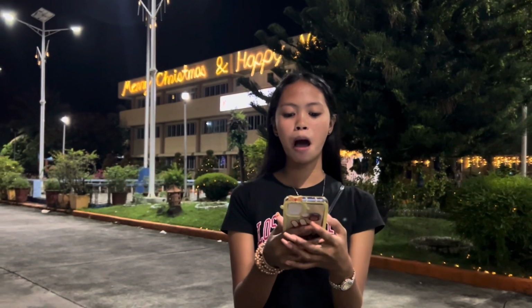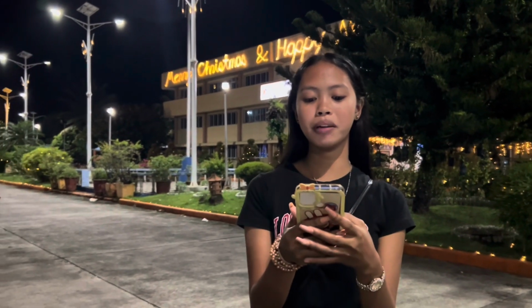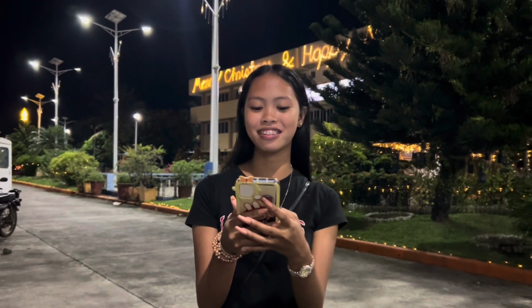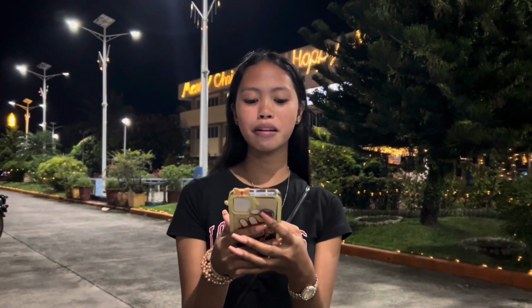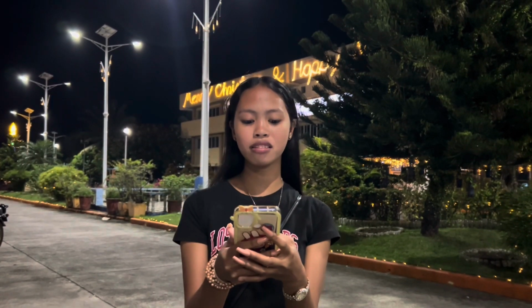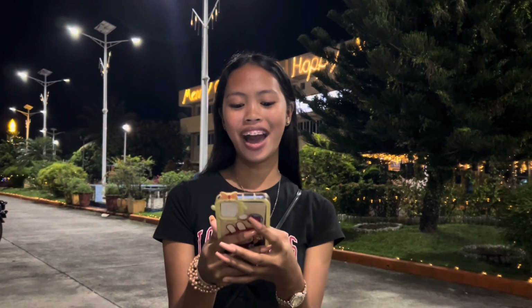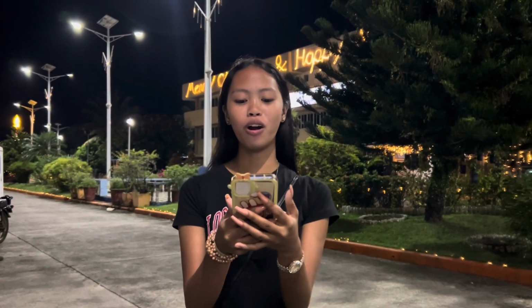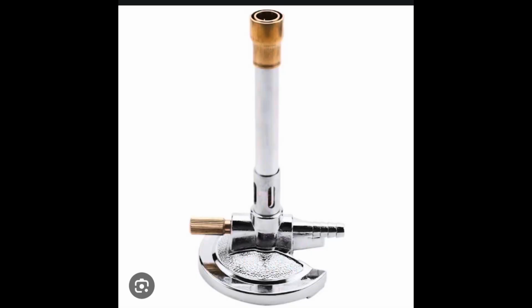A Bunsen burner is a type of gas burner that is used in many chemistry procedures in laboratory settings. It is used to heat substances, to combust substances, and to sterilize objects on high heat. Many different types of gases can be used in a burner, such as methane, butane, propane, or a mixture of them.